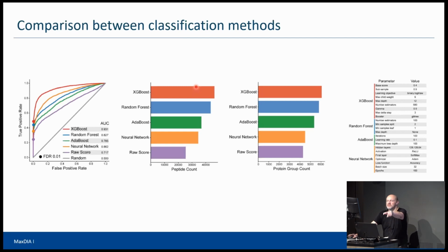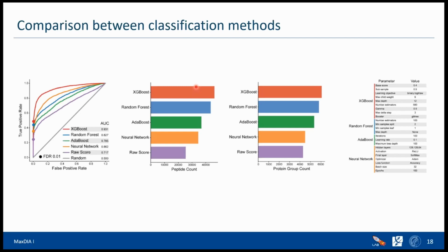I think there's a question over there. Standard DDA search, database search, decoy is reverse sequence. I wonder what is a decoy of a library? Does a decoy library have to be intentionally created during the library creation?